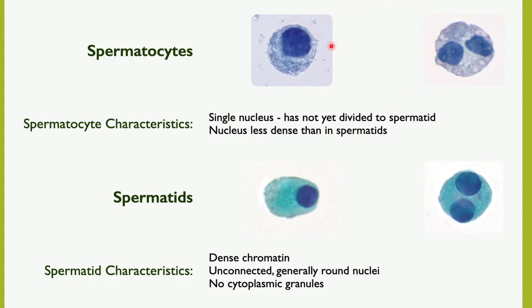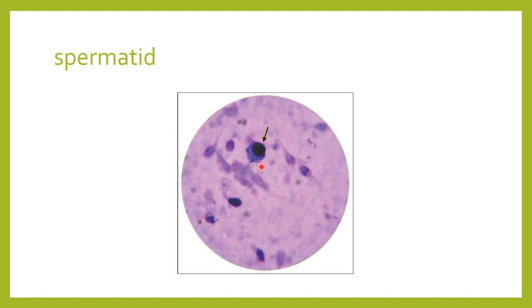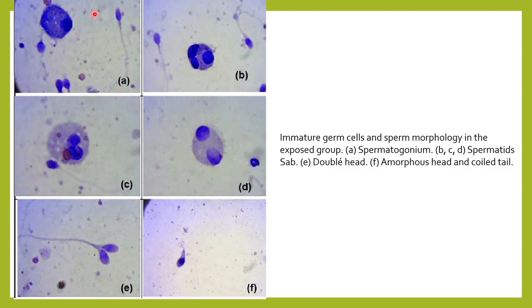These are the spermatocytes you can see here — they have a single nucleus and have not yet divided. Here you can see the spermatids; they have a little dense chromatin and no granules in the cytoplasm. Here you can see a primary spermatocyte with abundant cytoplasm and a large nucleus. Here is a spermatid with condensed nuclei and abundant cytoplasm with no cytoplasmic granules. Here is a spermatogonium, and B, C, D are spermatids. This is a double-headed sperm and this one has a coiled tail spermatozoa.